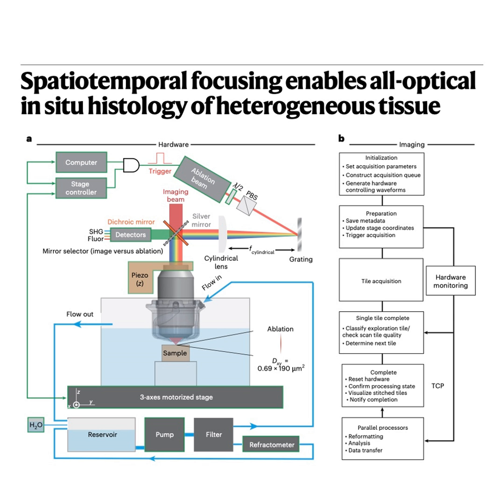Now we get to the smart part. You mentioned the robotic control pipeline. This is what manages the sheer complexity of cutting through different materials, layer by layer, autonomously for days. Right. Autonomy is the name of the game here. The software, largely based on open source tools, actually, is what orchestrates everything. The entire volume to be imaged and ablated is conceptually divided into many thin, partially overlapping layers. And it works through these layers iteratively.